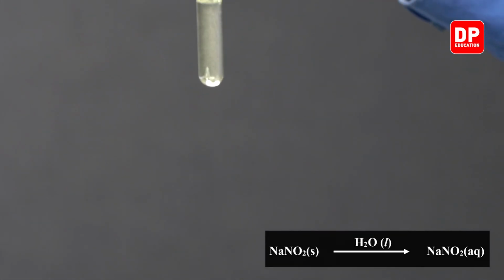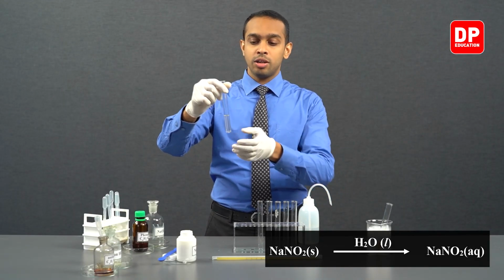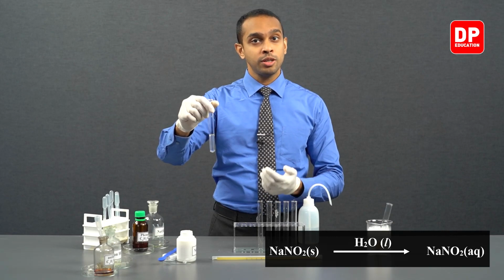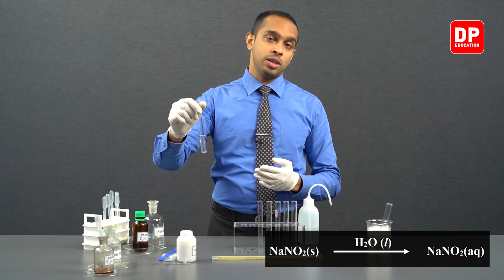And after completely dissolving sodium nitrite, we can place it in the ice bath to cool this solution also below 5 degrees Celsius.